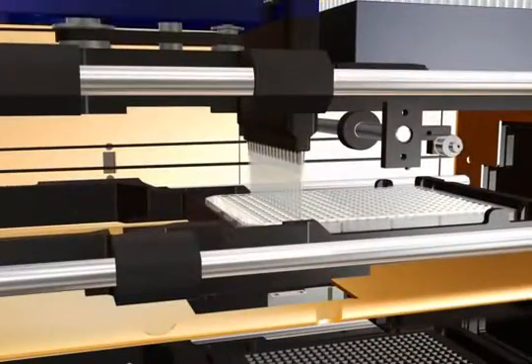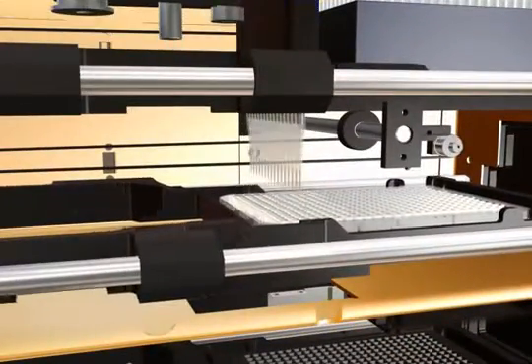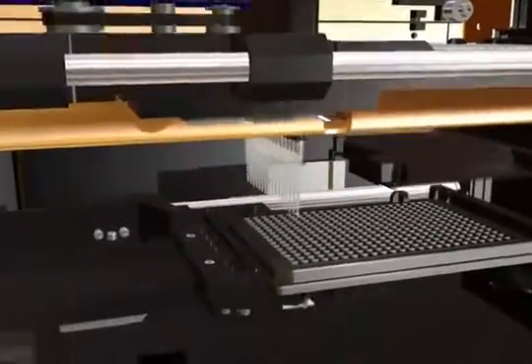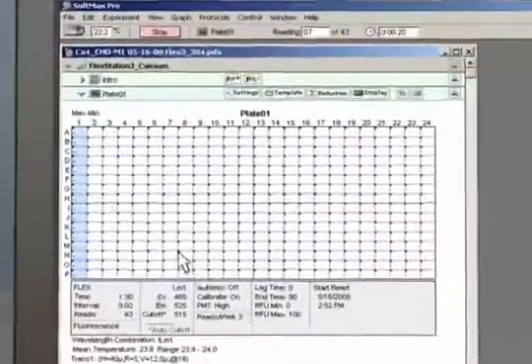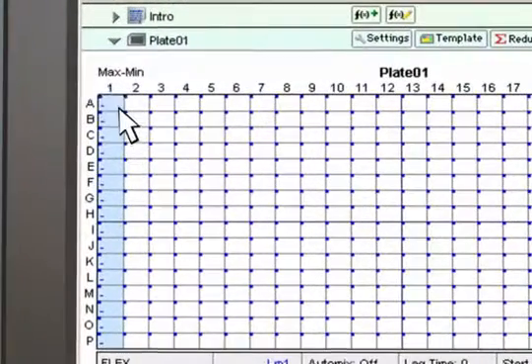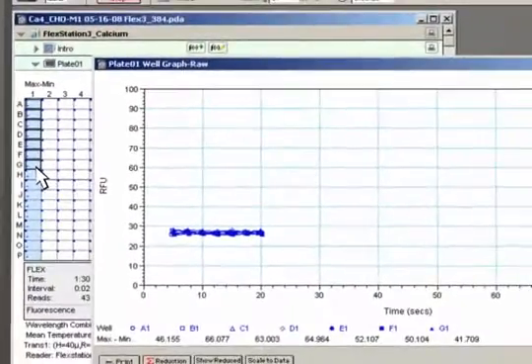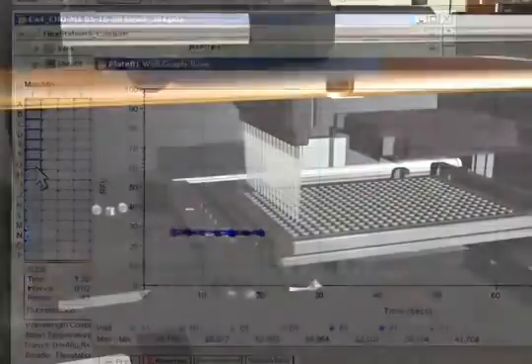The compounds are then transferred to a column of the assay plate. As soon as the read begins, you can view its progress in the Softmax Pro software.